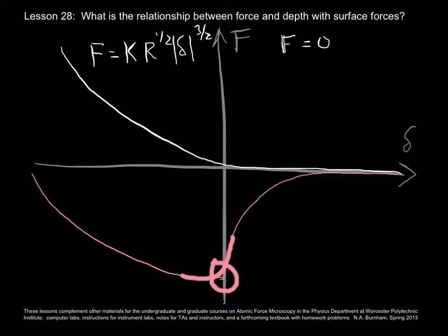regimes. The next thing you might think about doing is saying, okay, let's assume that I have no surface forces. I'm coming along and about to make contact, and then when I do make contact, I've got a fairly strong immediate chemical-like interaction, and then I load and unload, and as I pull tip and sample apart, I'm stretching the chemical bonds at the surface, and I'm forming an adhesive neck that suddenly rip apart.